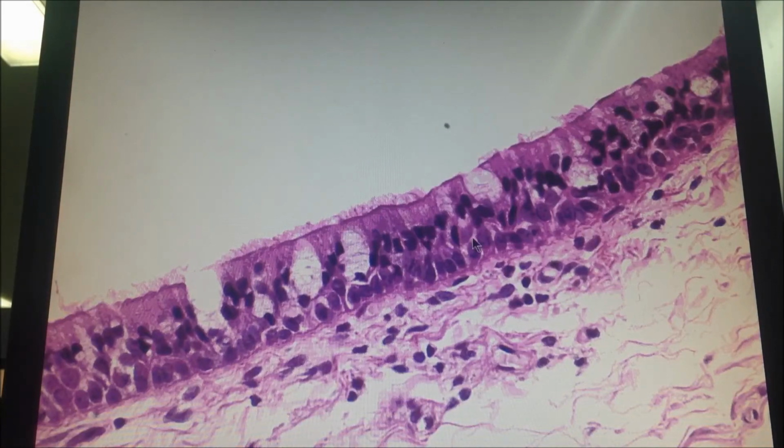نيجي لهون، light microscope، كالعادة بنشتغل systematic. قبل ما تروح على الconnective tissue، أول شيء حبة لومن لاين باي epithelium دائما وأبدا، مضبوط؟ شو نوع الepithelium اللي هون؟ What type of epithelium is that? الepithelium pseudostratified. How do you know? It's ciliated, goblet cells، والcells appear stratified multiple layers.